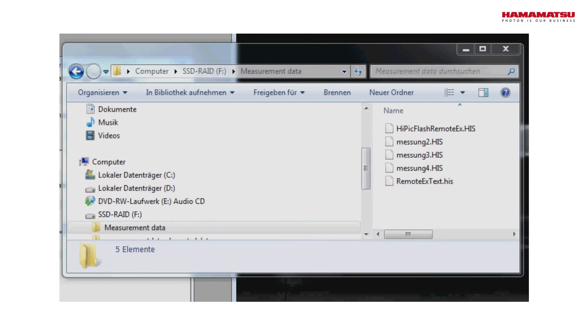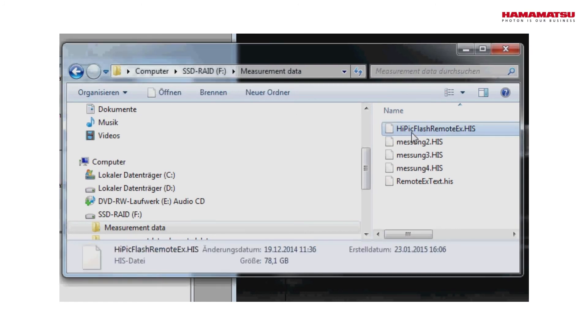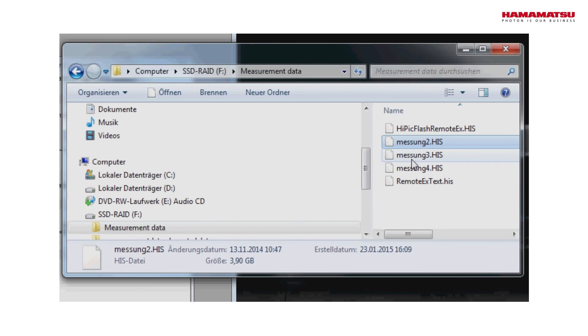At the end, all the experiment data is stored safely on the hard disks of the servers for evaluation.